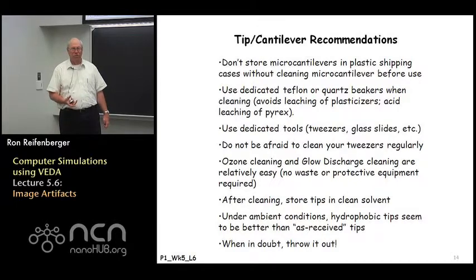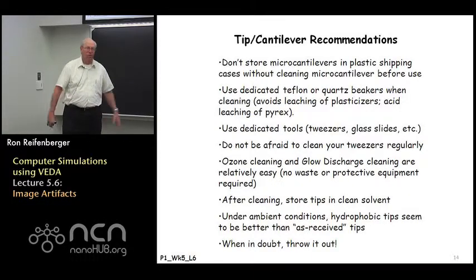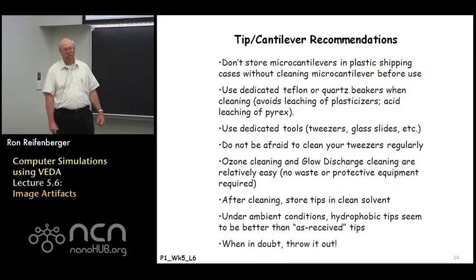So as soon as we get tips or a set of cantilevers, we remove them from the plastic that they're shipped in. We tend to store them in quartz beakers, Teflon beakers. The beakers are then covered up, labeled and stored. We use fine tools in the handling of these cantilever chips. And these tools are dedicated to each student, so one student has control of their own tools. They're not commonly shared. This way you have some ability to control how clean they are, and students maintain the tools on their own. They're not a common use facility.